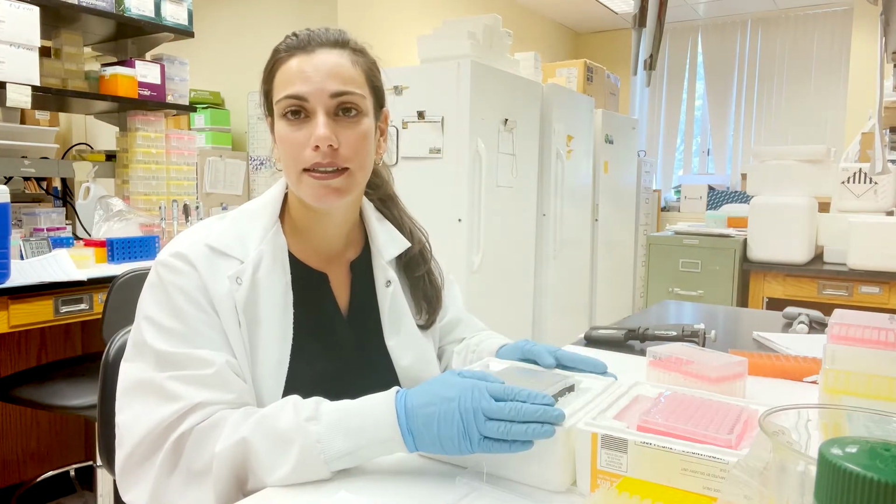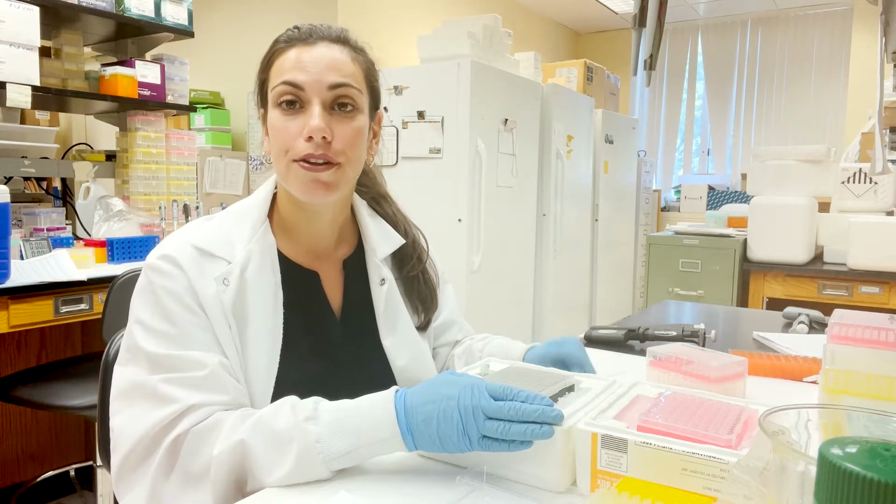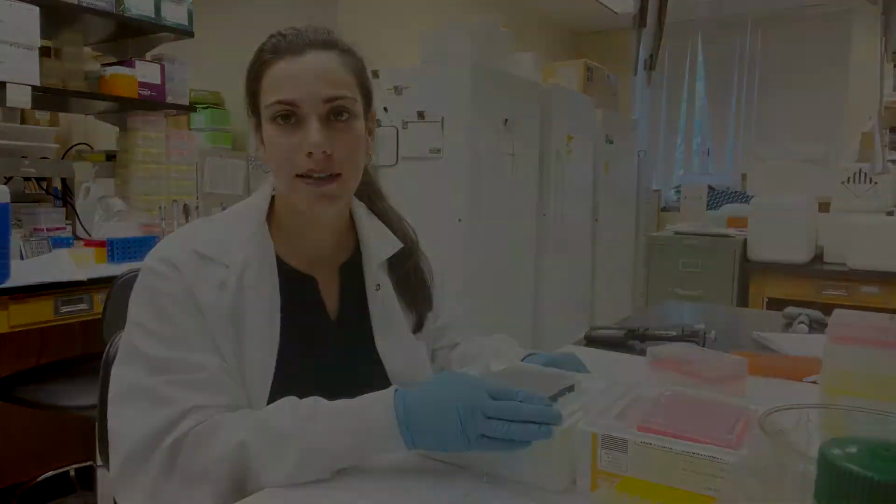Lastly, we spin the plate down to remove any air bubbles, and we put it on the thermocycler at 37 degrees Celsius for 2 hours.